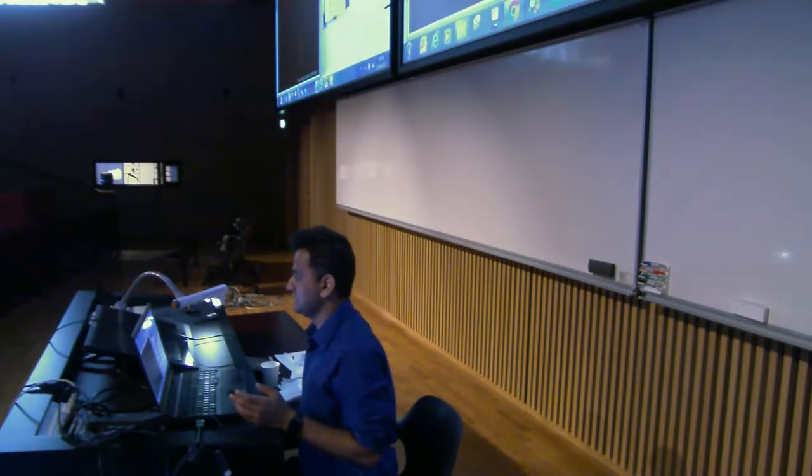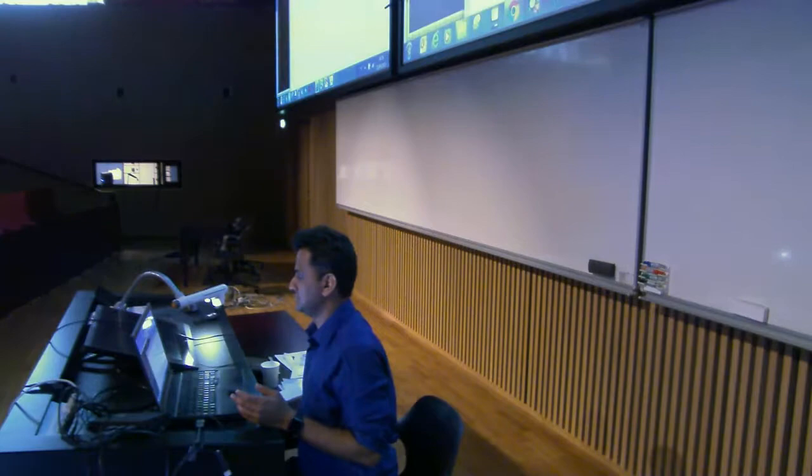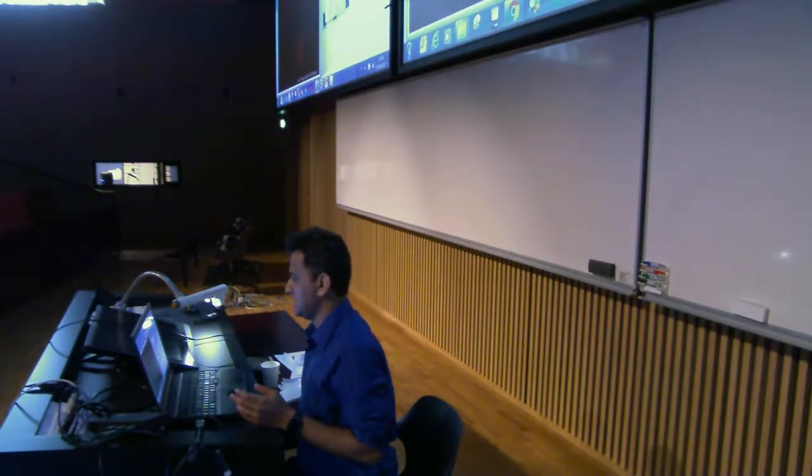But let's see if I select this one and say analyze and measure. Okay, what is the value here? The value is 1523, and when I say apply, say auto, say apply, analyze, measure.